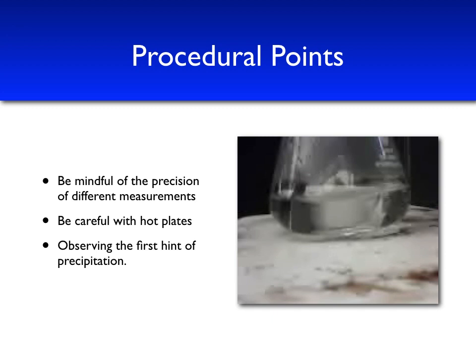As mentioned in your lab introduction, it is important that we look for the first hint of precipitation formation. This is at the beginning of the formation of our saturated solution, where we can know our concentrations of potassium and hydrogen tartrate ions. If we wait too long, then our concentrations will become unknown.